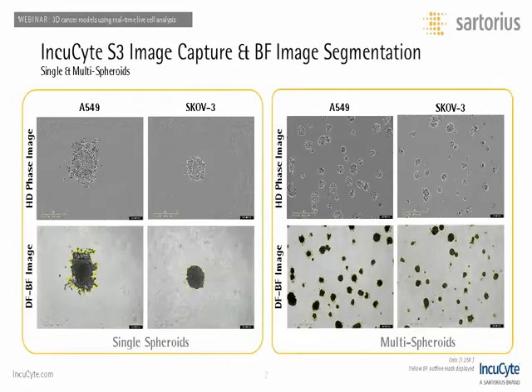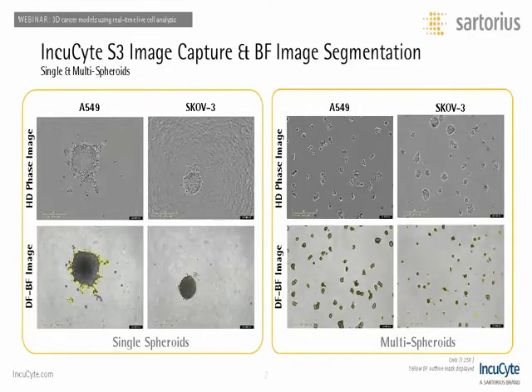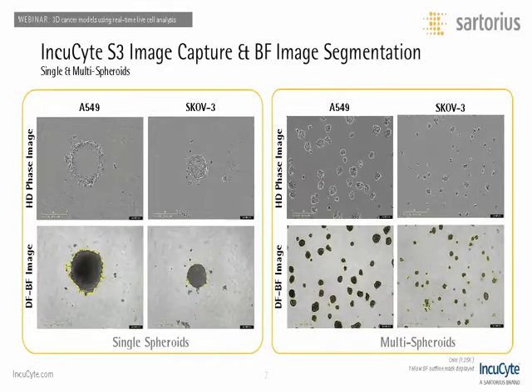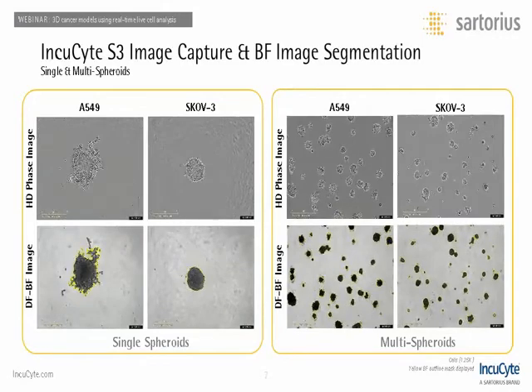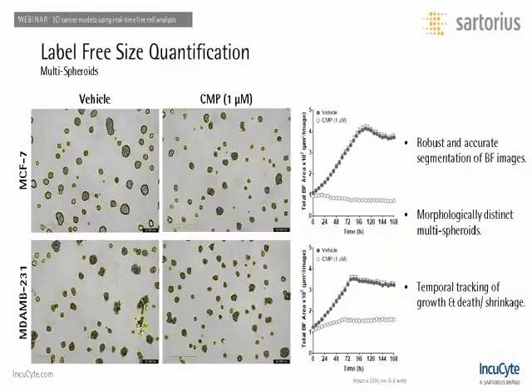Here, we use a proprietary method to capture depth of focus bright field images from both of these models. Note how the IncuCyte is able to consistently mask these bright field images over time, as shown by the yellow outline mask on the bright field images.